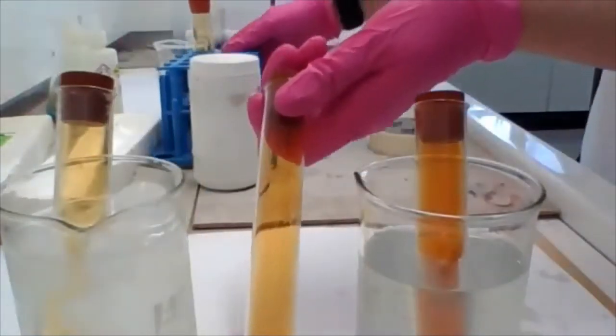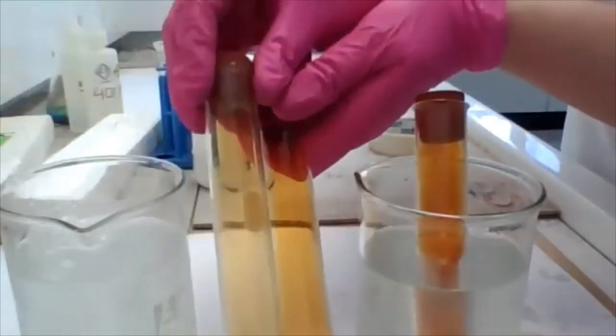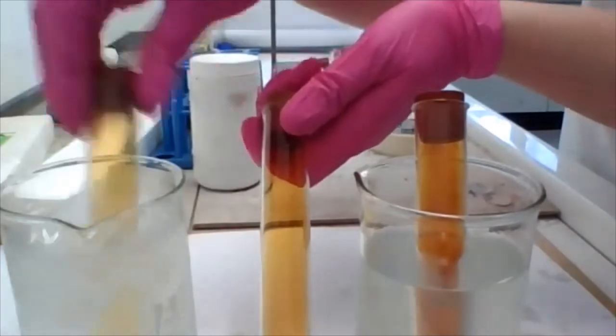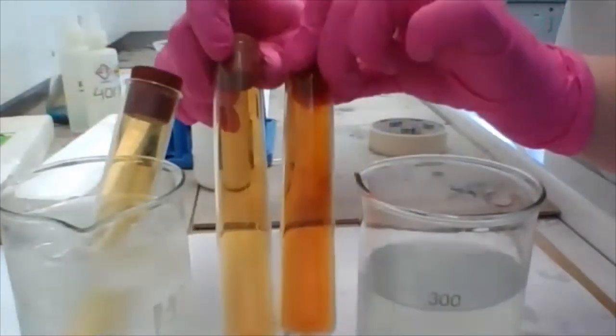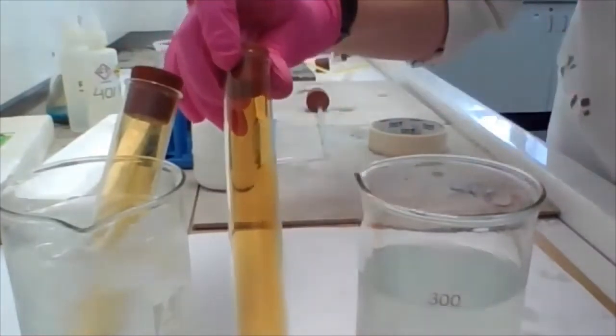Now, of course, that blue test tube rack is in the way. So comparing the cold on the left to the room temperature on the right, the room temperature on the left, and then the hot on the right.